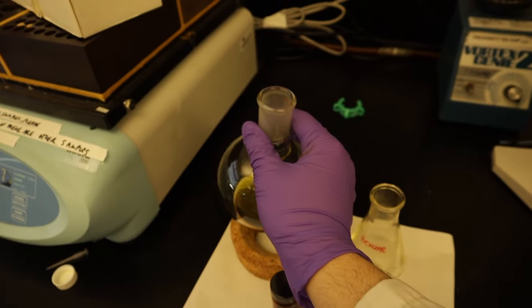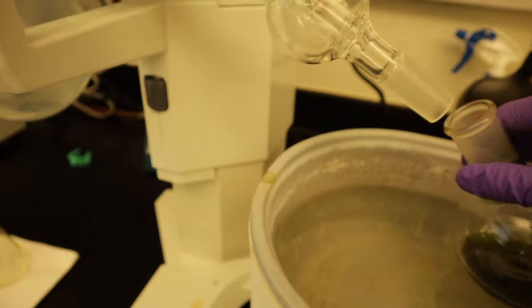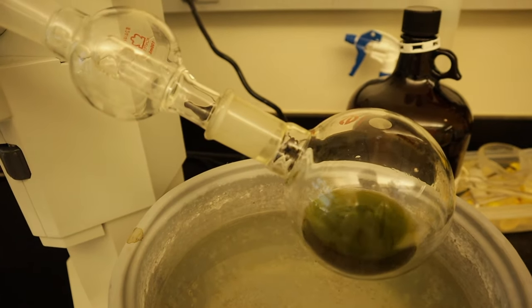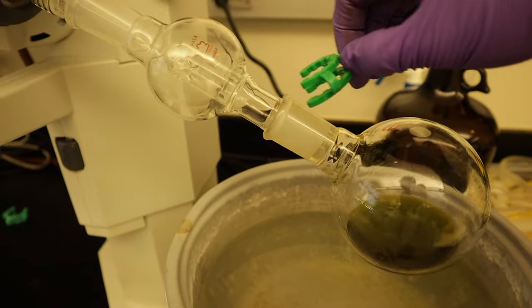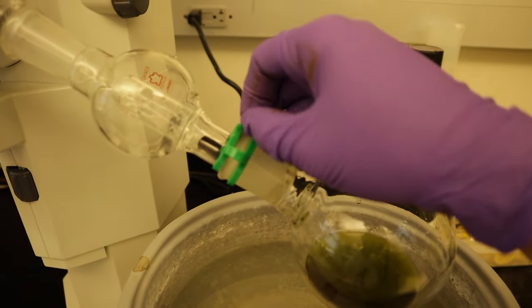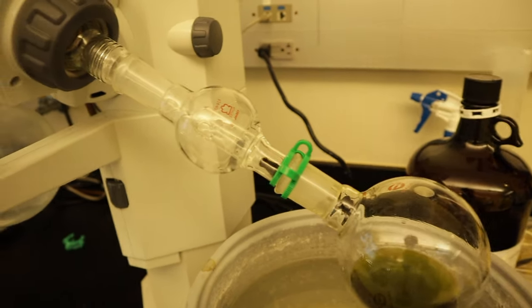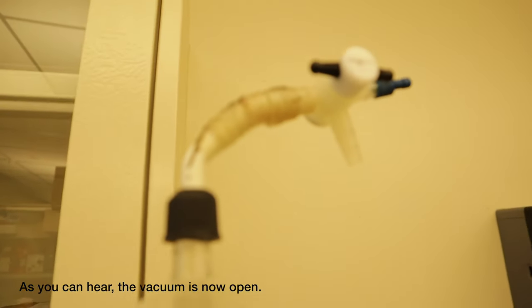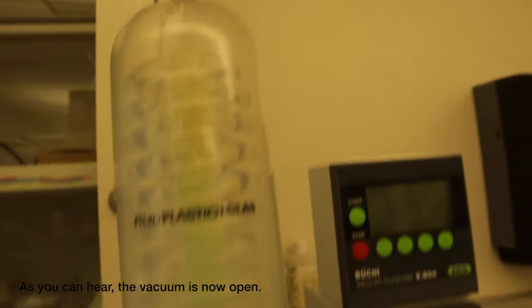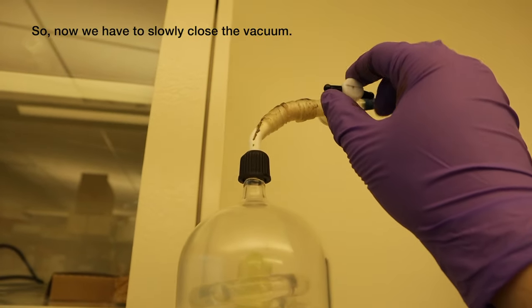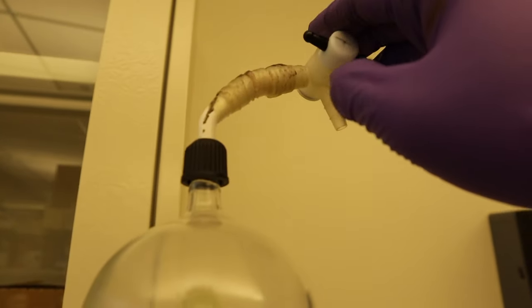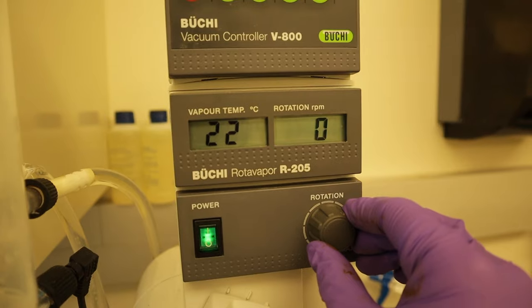We'll be putting this round flask here and we will lock it using this one so it will not fall off. The next step is to turn on the vacuum. Then, turn on the heating bath.